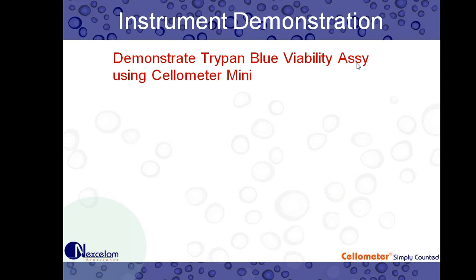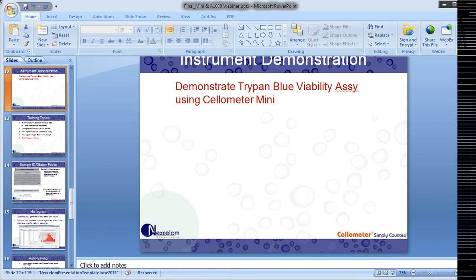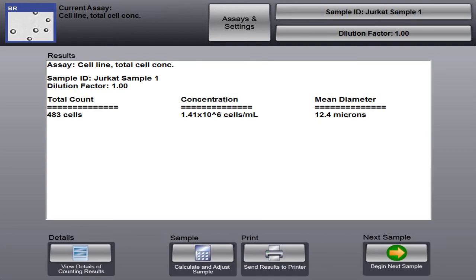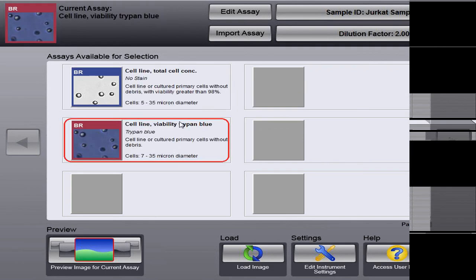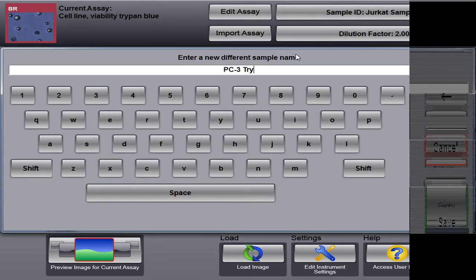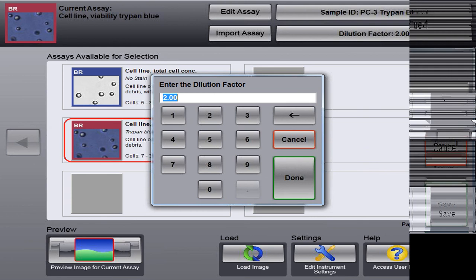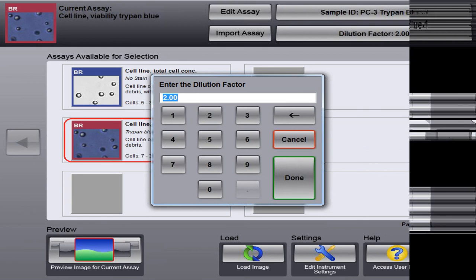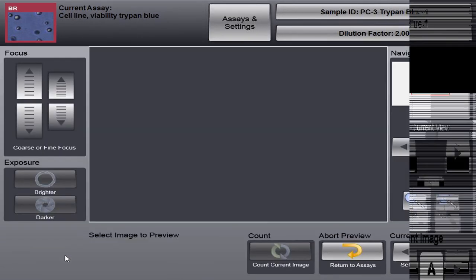So now I'm just going to switch back. We'll switch back to the software. And on this next slide, we have PC3's prostate cancer cells stained with Trypan Blue. So I'm just putting the slide in the instrument. I'm going to go back to our home screen by clicking Assays and Settings. And you see here that our current assay selected is cell line total cell concentration. We want the viability Trypan Blue assay. So I'm going to click on that. Again, it's outlined in red. I'm going to adjust our sample ID to say PC3 Trypan Blue-1. We'll save that. And then you'll notice our dilution factor is a default of two. That's because we did a one-to-one dilution with Trypan Blue in cell samples. So we'll leave that. We're ready to count. I'm going to click Preview.